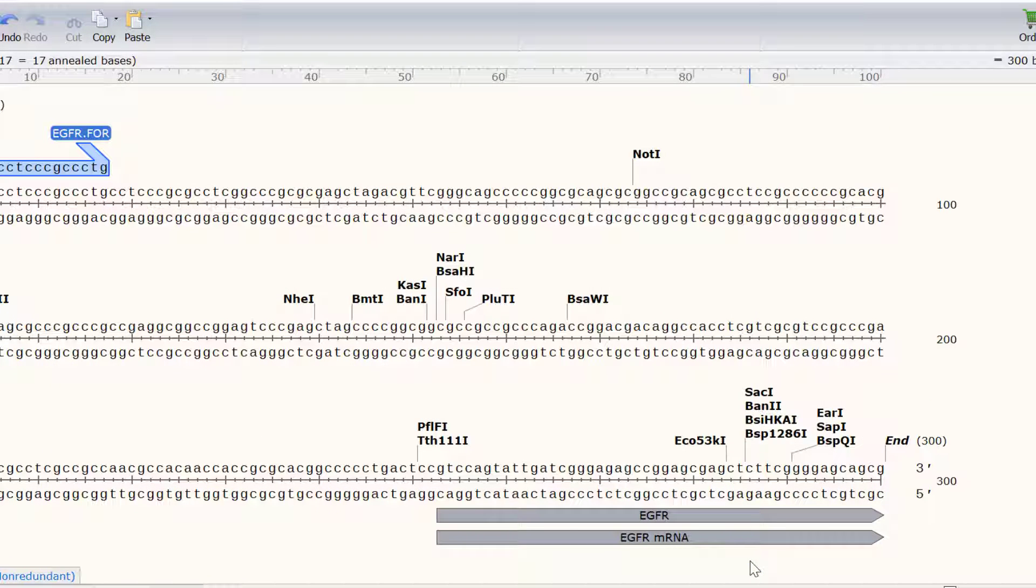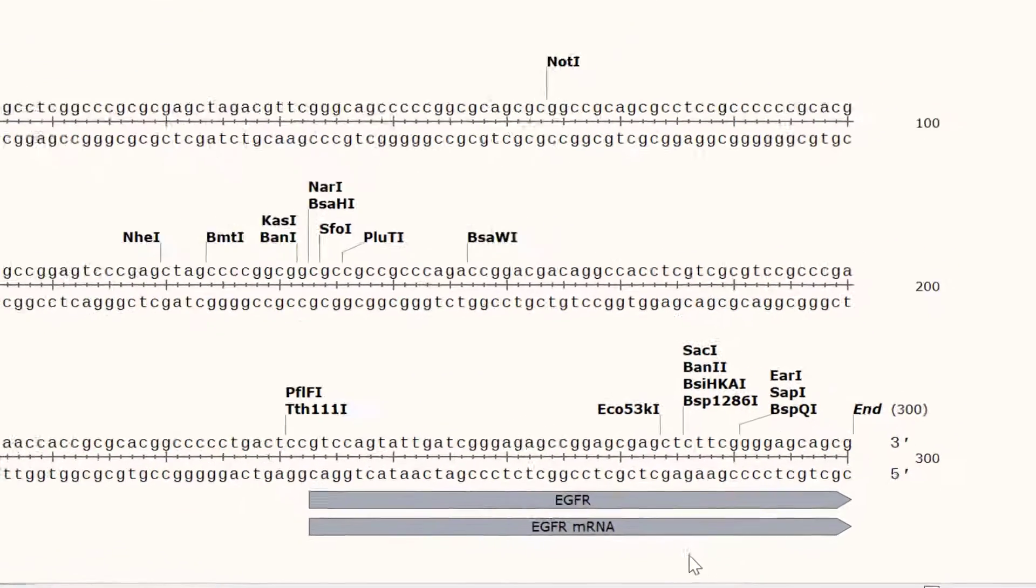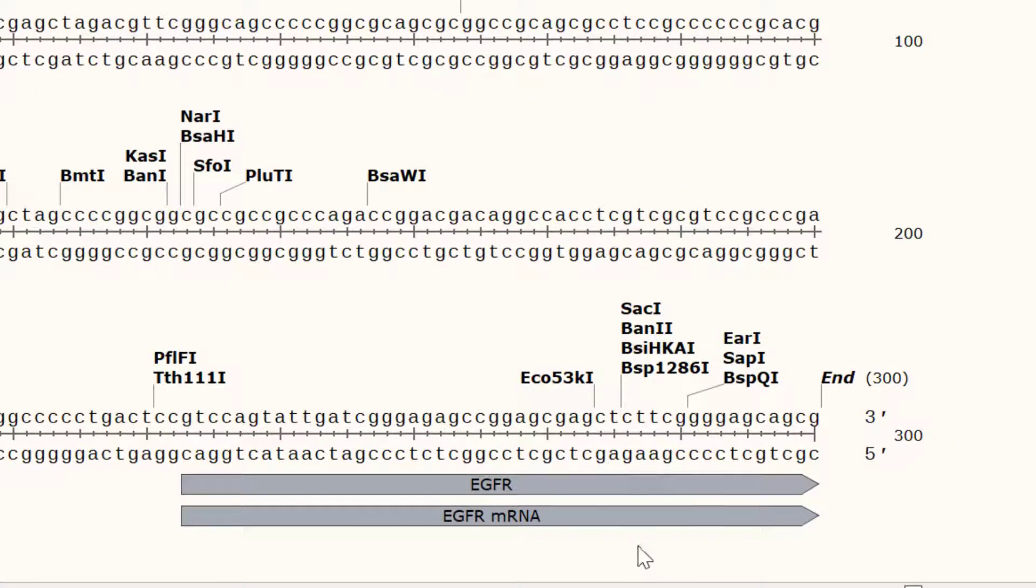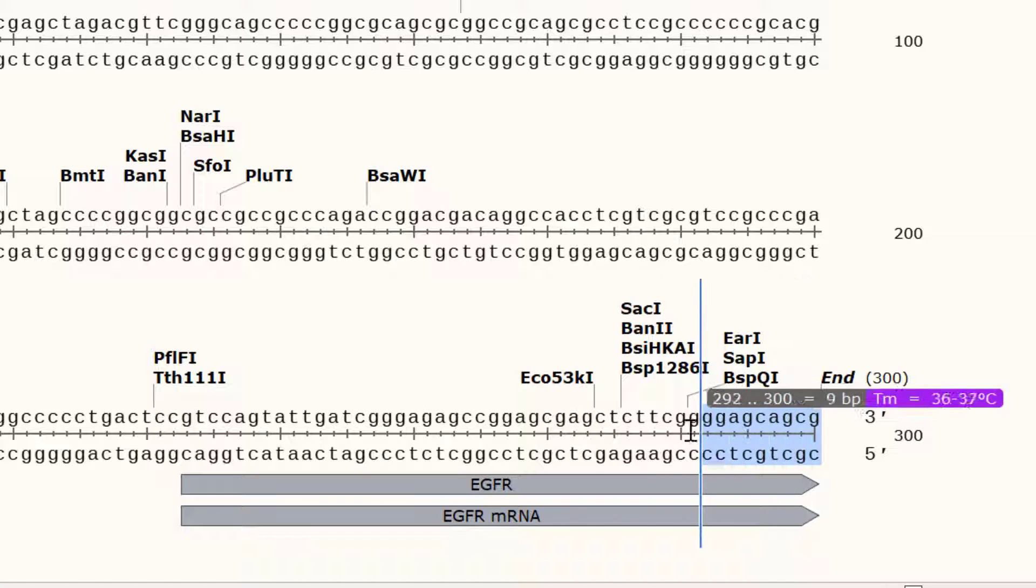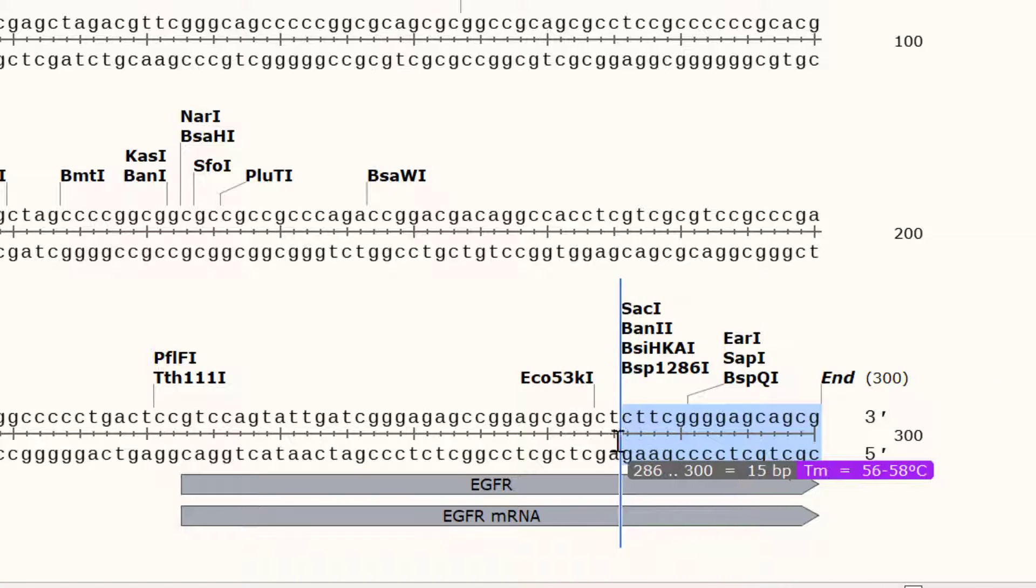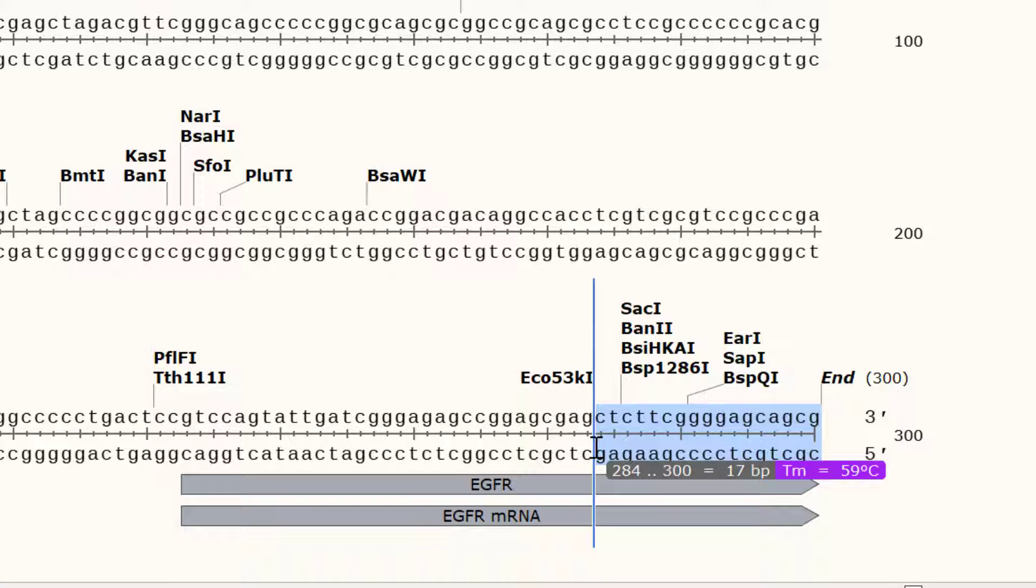I will now do a similar process to add the XHO1 site to the end of the sequence. Again I will click and drag on the sequence to select the bases that give me a melting temperature of approximately 60 degrees Celsius. In this case this is 17 bases.